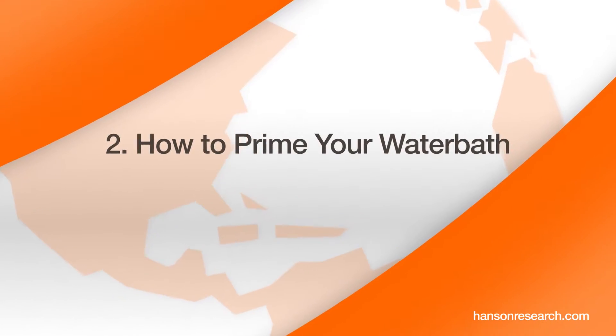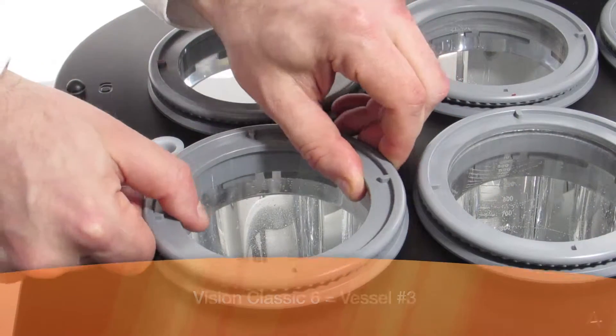How to prime your water bath. Remove vessel number 5.